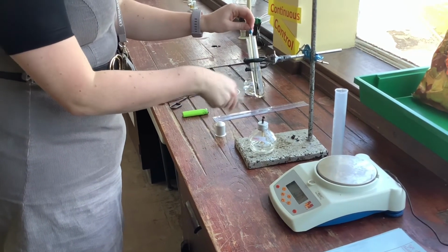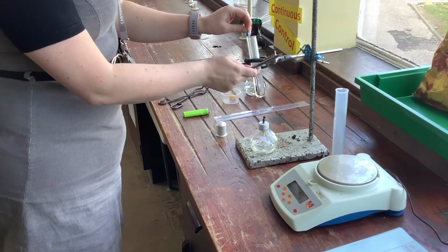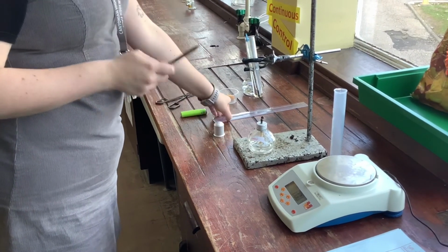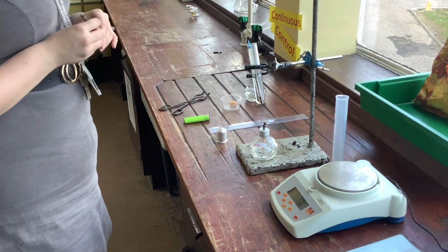Also, you're recording the temperature of the water right down here. That doesn't necessarily mean that the temperature of the water is the same up here, so you might want to stir it. The biggest control variable is the distance from the flame to the tip of the boiling tube.